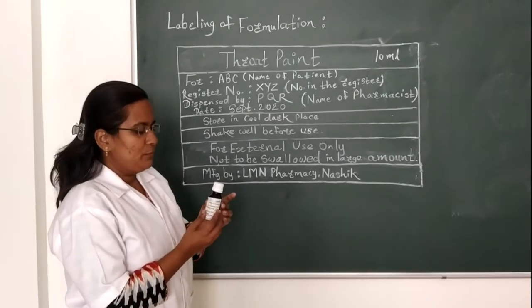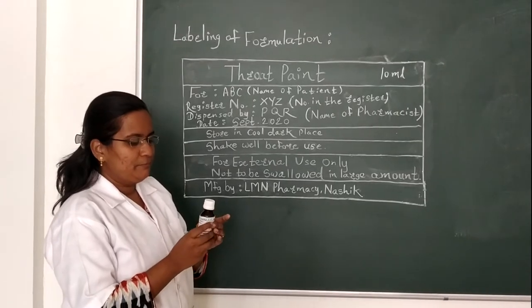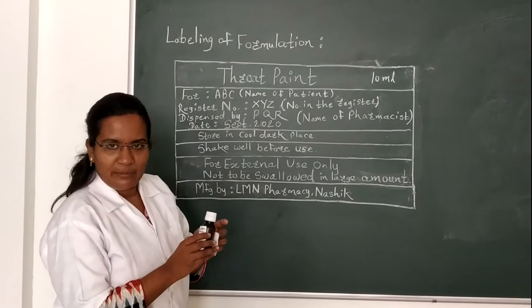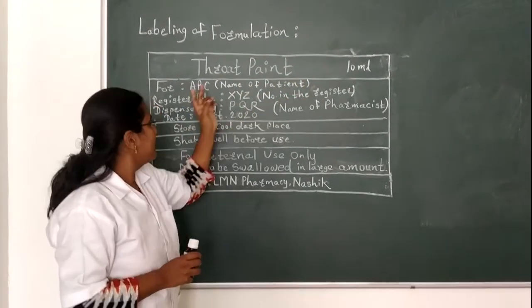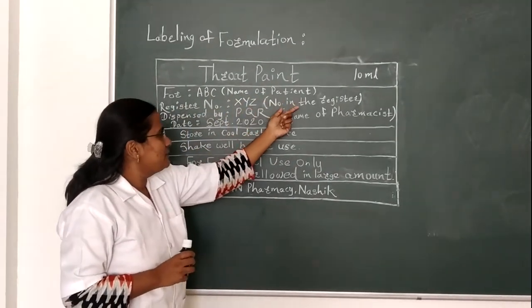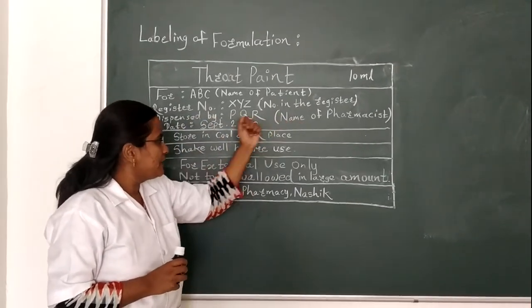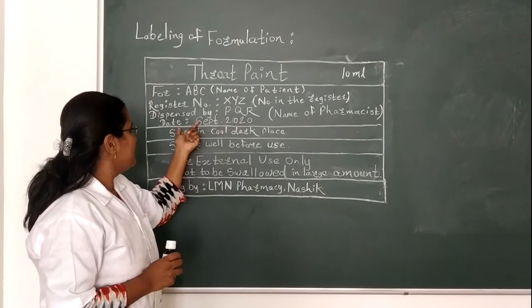Now let's move for labeling. As we fill our formulation into this colored bottle, we also prepare the label. See the label - Treatment for ABC (here one can write patient name), register number XYZ, dispensed by PQR (name of pharmacist), date September 2020, this is the manufacturing date.